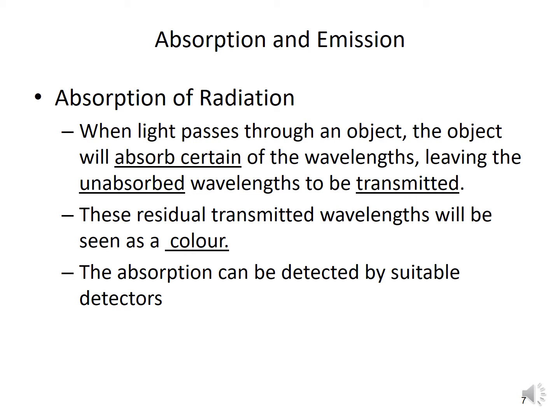The transmitted energy can be seen as a color, especially in the visible range. In the ultraviolet range, it is difficult to identify the color.